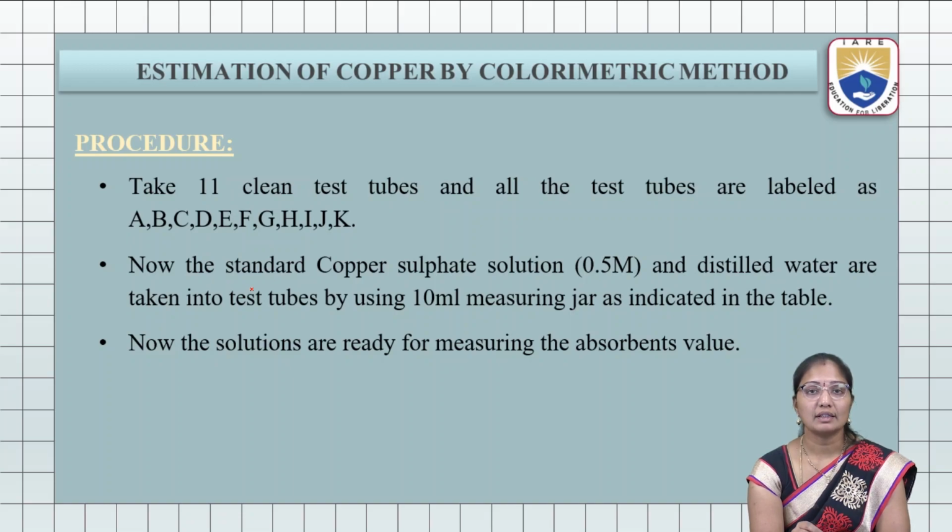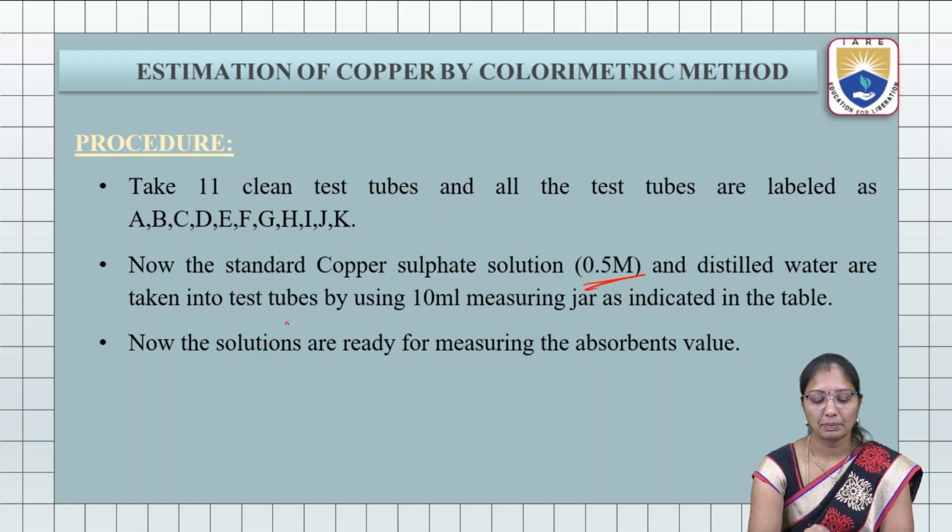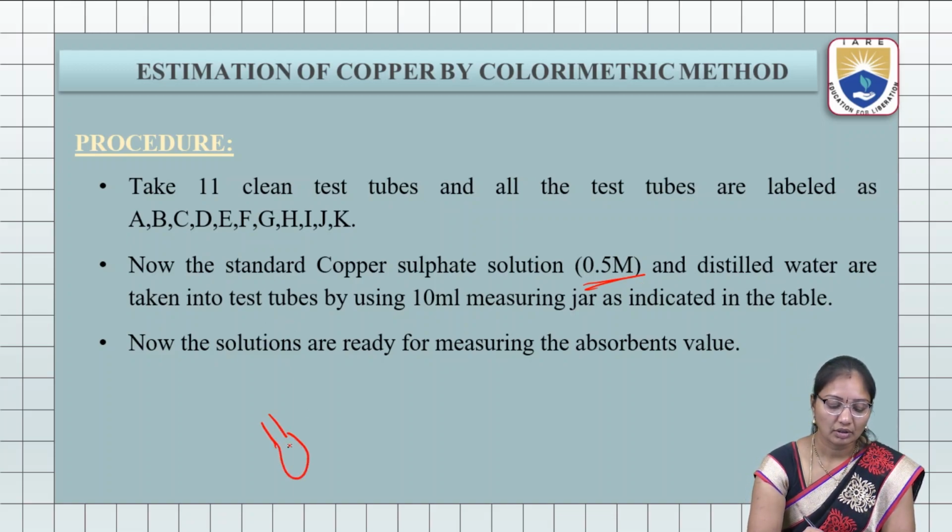Now, a standard copper sulfate solution, or mother solution, of 0.5 molar concentration of copper sulfate, CuSO4, has to be prepared. This is the mother solution.